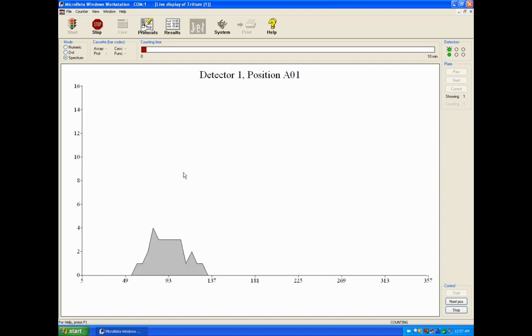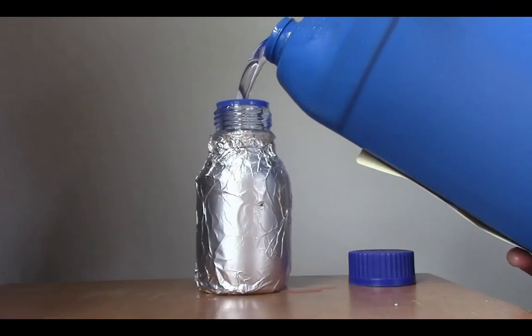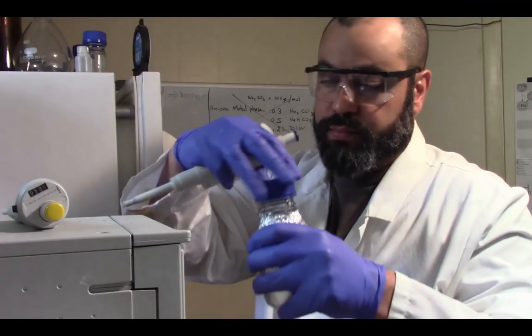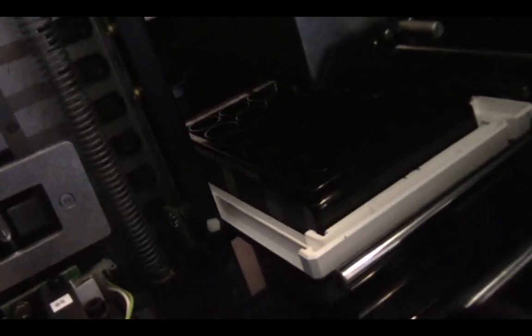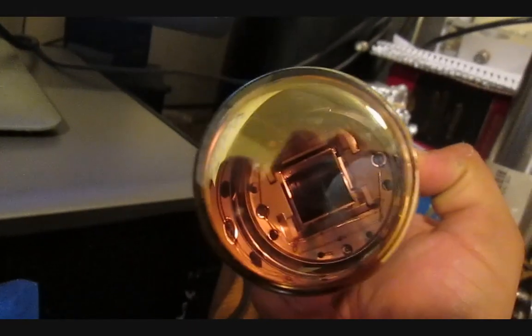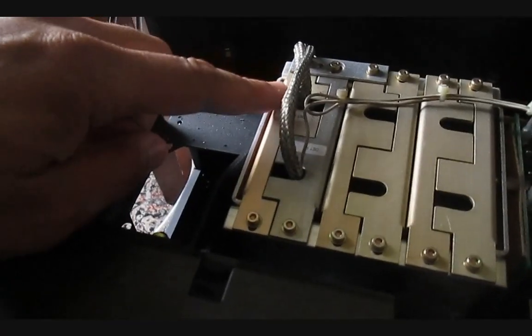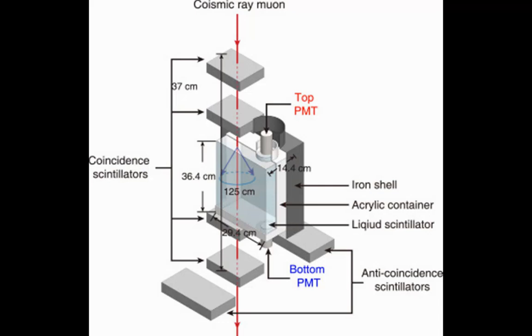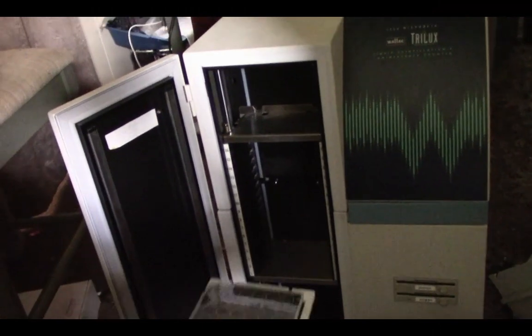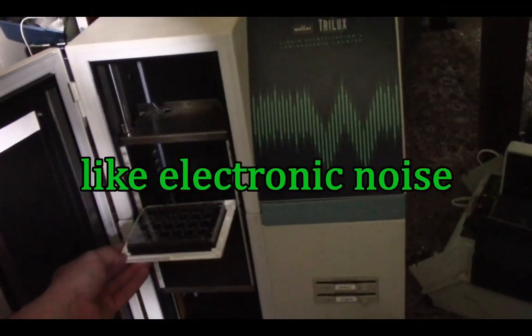The sample must be clear, and is mixed with the liquid scintillator at a third dilution. This is then carried to the detector, and the counting begins. Two photomultiplier tubes, or PMTs, are looking at the sample from opposite directions. They are wired in coincidence, which means only photons detected by both PMTs are counted. And that way, interferences and single events can be weeded out.